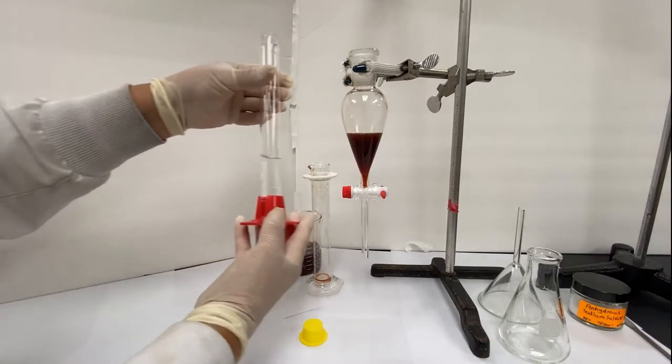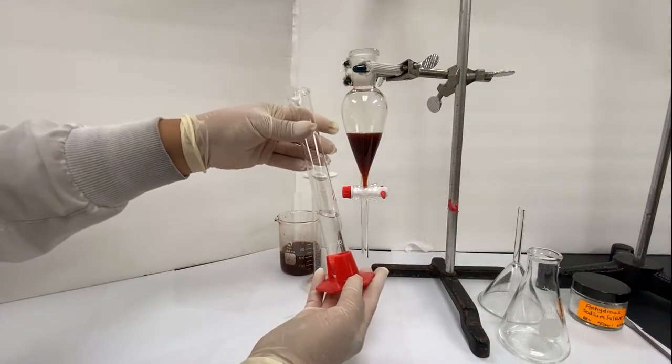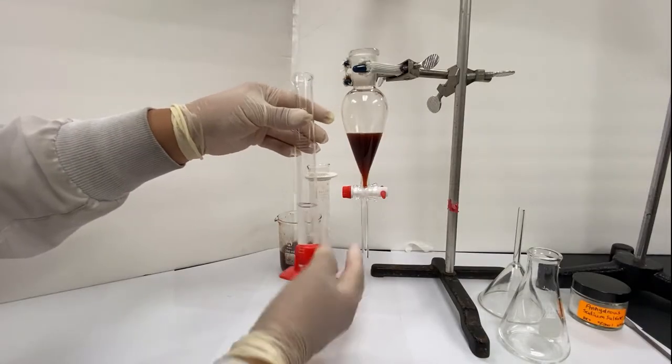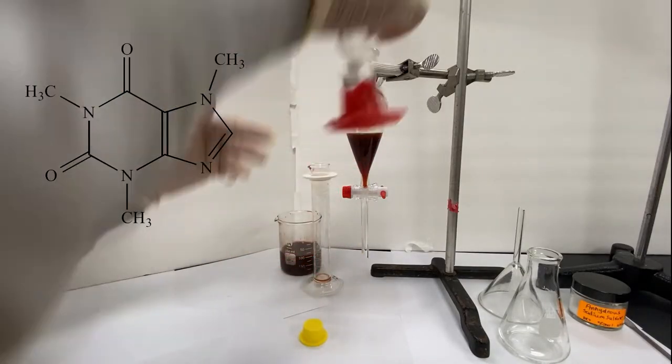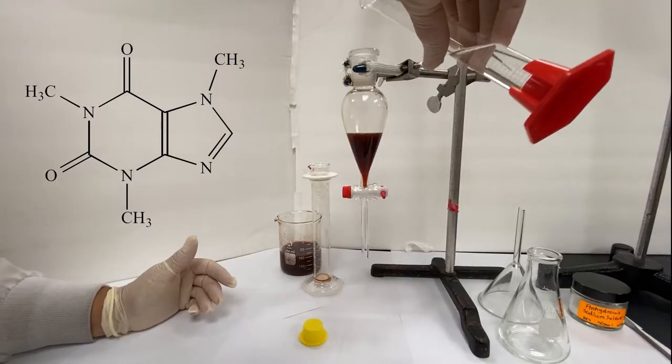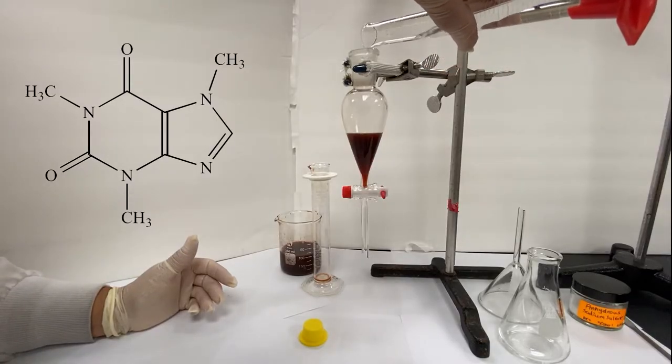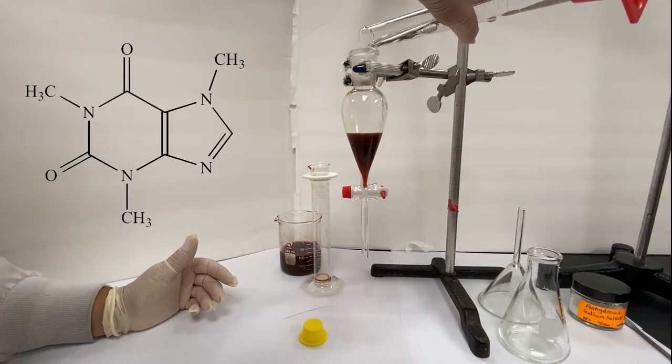To perform the extraction, we will need to use a solvent which the caffeine will be more soluble in than water and will also have some other property to separate itself from the rest of the tea. If we look at the structure of caffeine, we can see why it's considered slightly soluble in water with its polar groups. We can increase its solubility in water by increasing the temperature, which is why we boiled the tea in the first place. We can also see by its structure that it will be soluble in certain organic solvents as well.